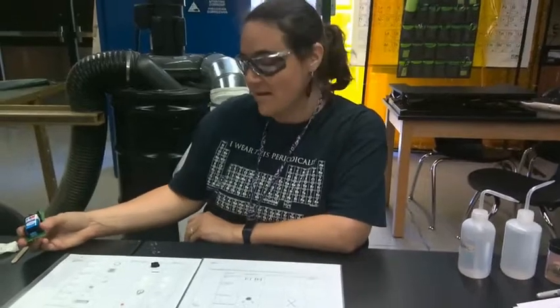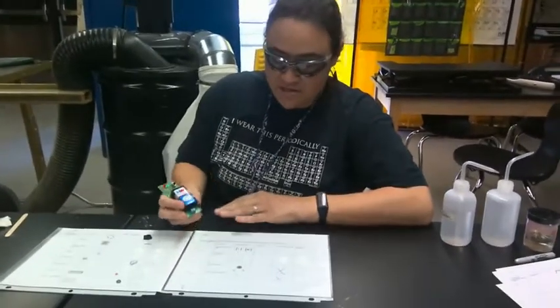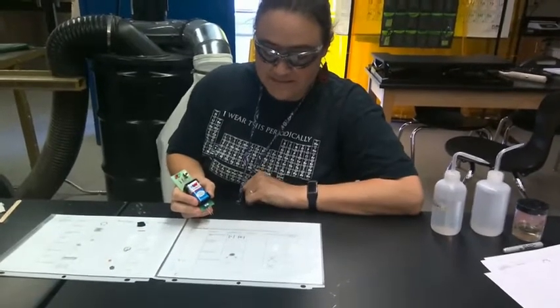Taja, and if you missed the conductivity lab, you are watching this virtual lab. So let's get started. In class, we did a demo with these four substances, starting with potassium bromide.